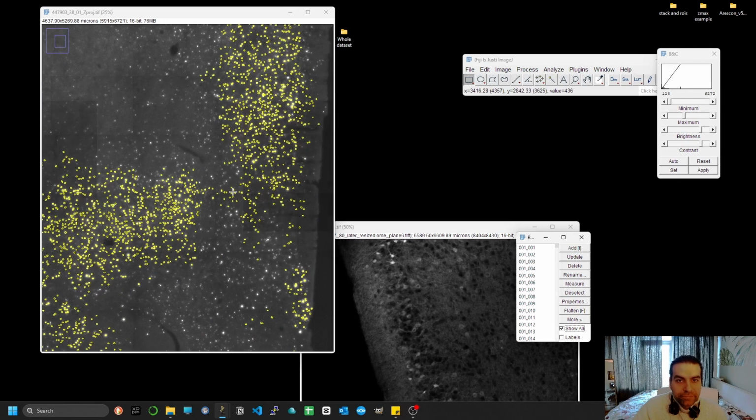And I suppose the reason that this is happening is that you have more artificial objects when you do the Z-max projection. It's a tough word to say. And this probably affects the inferences and the ability of the network to reliably detect cells.